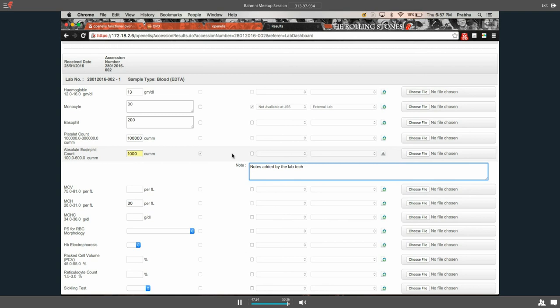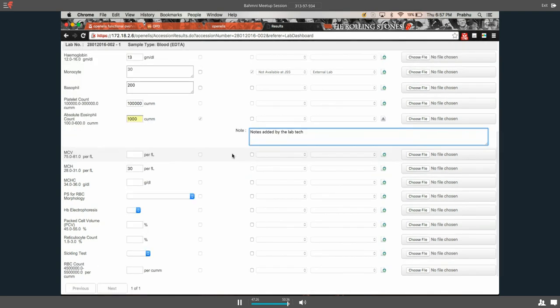So Tim, can you give some examples of tests where it's beyond the equipment range? It happened to us recently, about 2 months ago or something. I remember the test could only go up to a certain limit. I think it was something to do with diabetic patients.